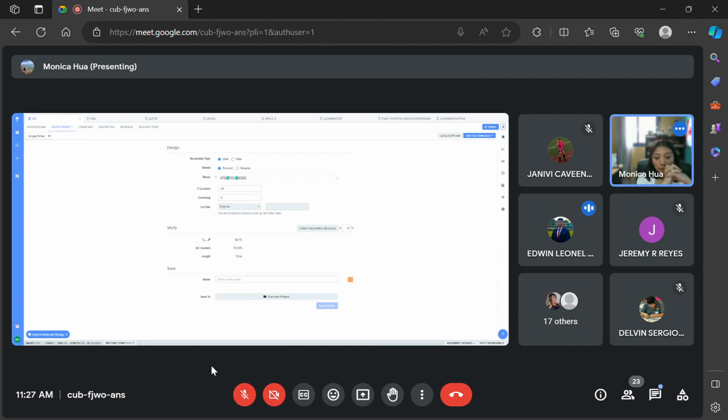You're at 56, right? 56, you can decrease the number of base pairs, but again, if you are at 15 base pairs, that's where you want to cut it. You don't want to go any lower. You might have random PCR product because your primer is sticking to all kinds of sequences. So you want to make sure your sequence is at 15 or above, and you want to make sure annealing temperature is not above 60. You want to make sure that the GC content is around 50, which is the best. You could go a little higher, that's fine, but too high is not good.